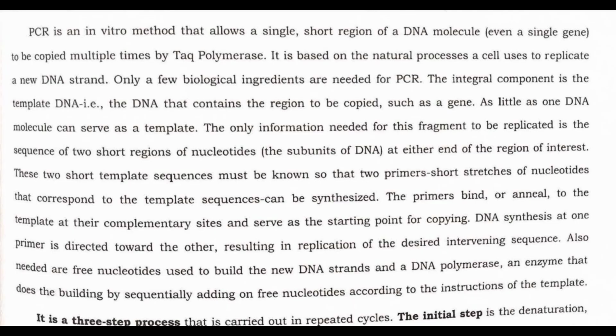These two short template sequences must be known so that two primers, short stretches of nucleotides that correspond to the template sequence, can be synthesized. The primers bind or anneal to the template at their complementary site and serve as the starting point for copying. DNA synthesis at one primer is directed towards the other, resulting in replication of the desired intervening sequence.